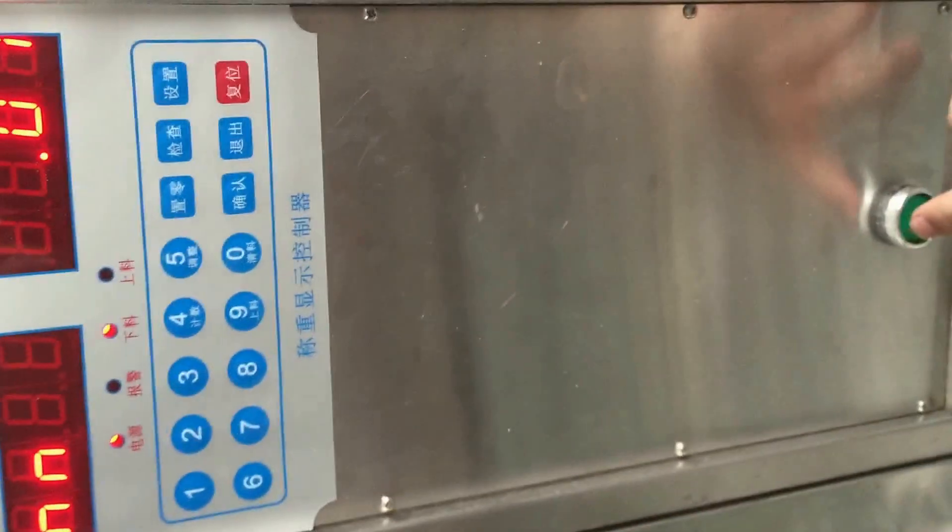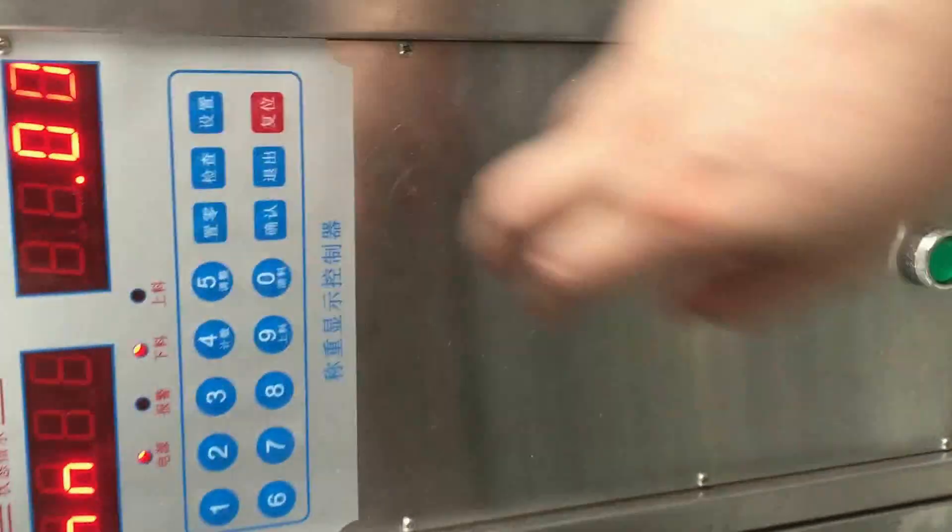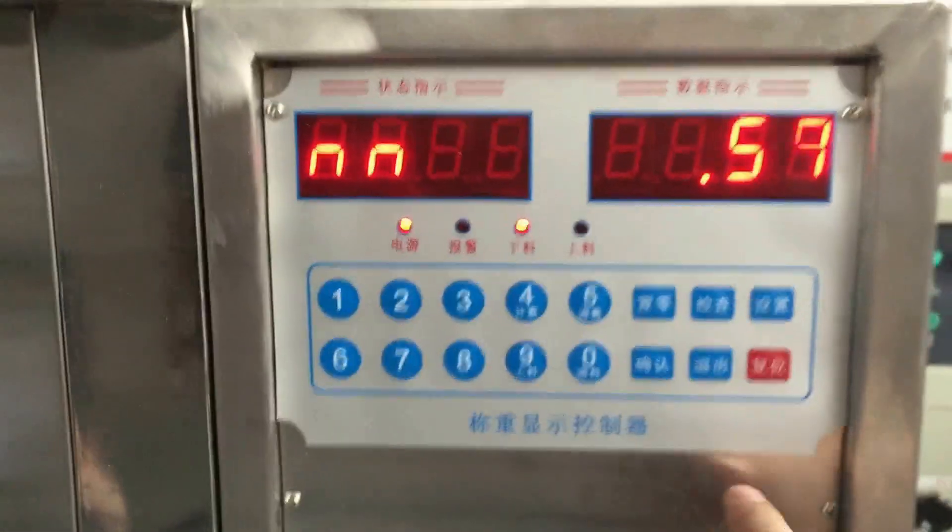Now, let's explain how to set up the filling volume. First, press this green button. The machine will start to work. And second, let's turn to the control panel.